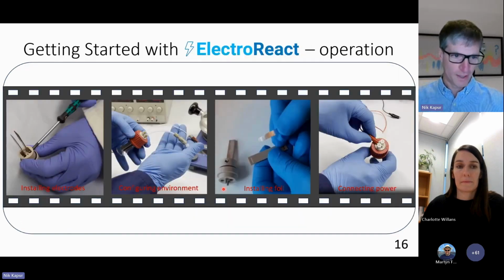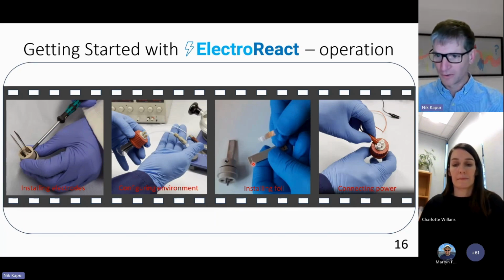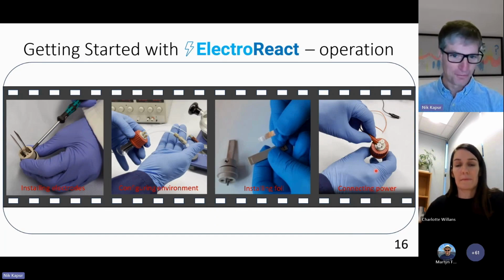I'm not going to run the videos. You'll have time afterwards to go and investigate that. But there are videos on installing electrodes, configuring the gas environment around your bottle reactor or your ElectroReact platform, how you go about folding and inserting the foil, which, again, is just a 2 or 3 minute job. After you've done it once, it just becomes second nature, and how you go about connecting power. So all really straightforward operations. Once you've done them once or twice, it becomes entirely obvious, and this just gets you going really quickly.